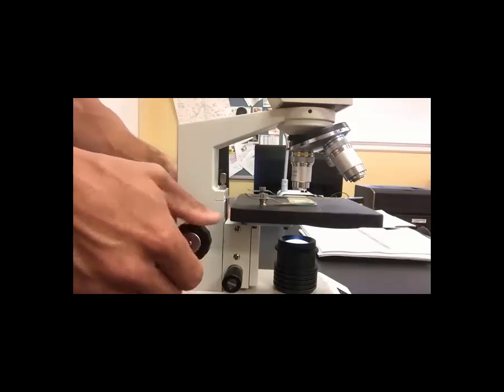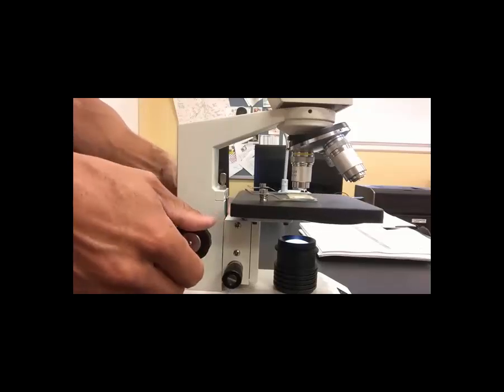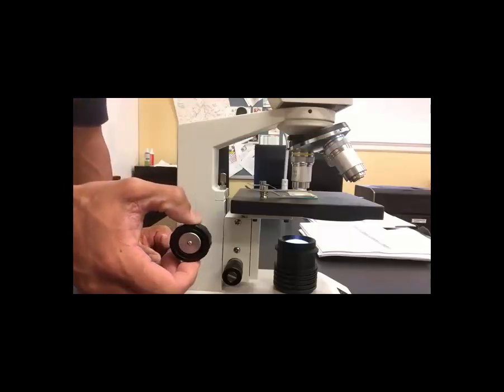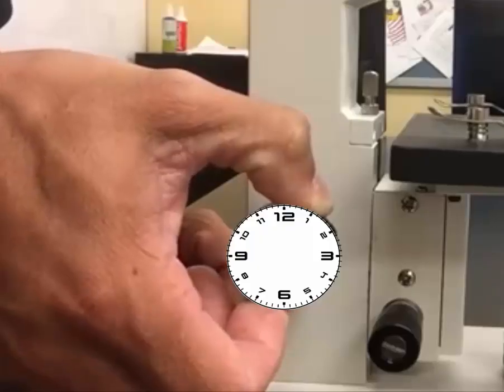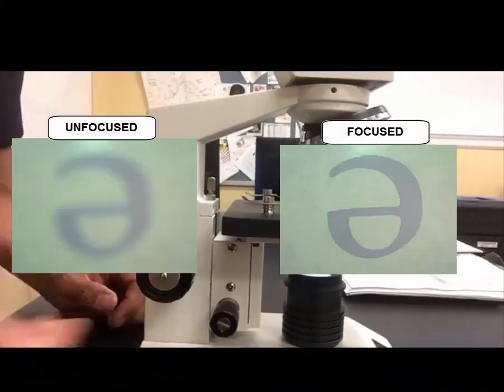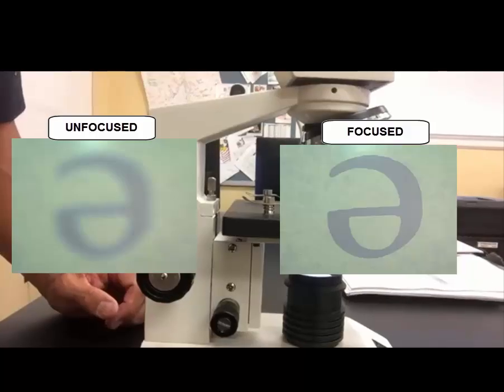We'll then turn the coarse adjustment knob until the stage comes all the way up, and this will bring the image out of focus as you can see here. If you take a look, I place my thumb at the 12 o'clock position to show you how little I have to turn it. I barely move it towards the 1 o'clock position, and this will bring the image into focus and give you a crisp picture like this.